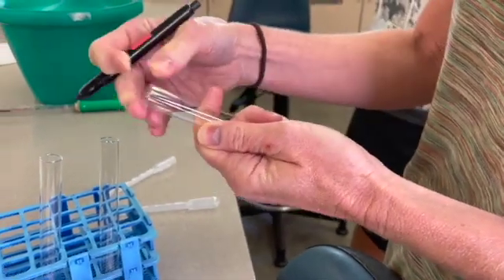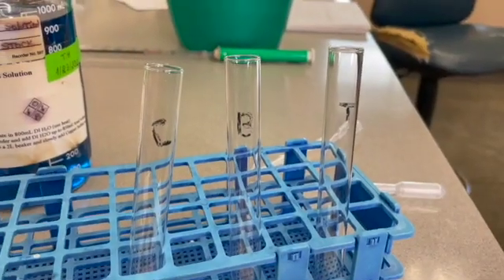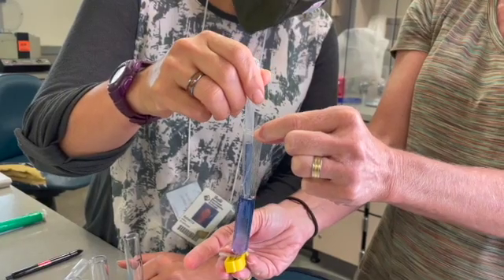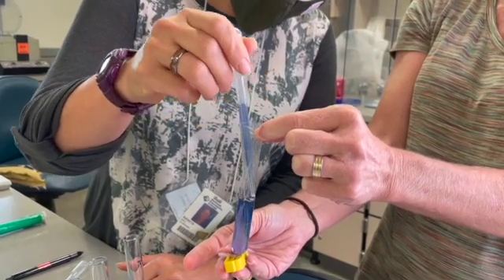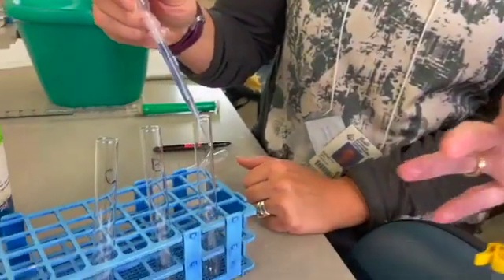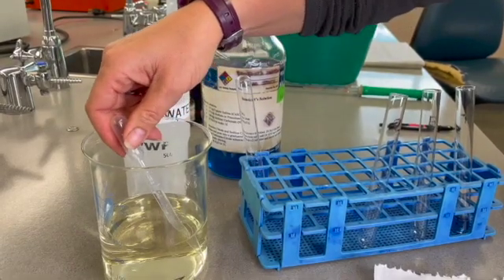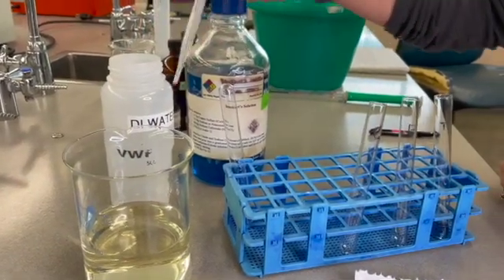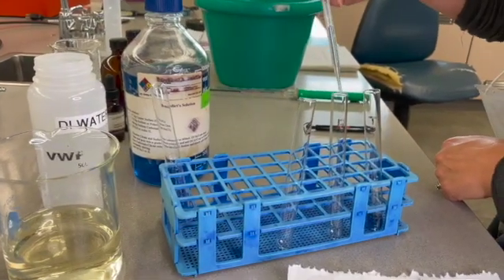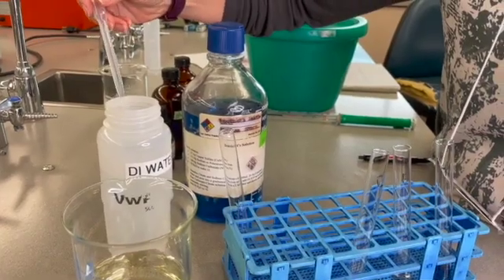We label 3 test tubes, C for control, B for beaker solution, and T for dialysis tube solution. We now add 2 milliliters of solution from the dialysis tubing to the test tube labeled T, 2 milliliters of the solution from the beaker to the test tube labeled B, and we add 2 milliliters of deionized water to the control test tube.